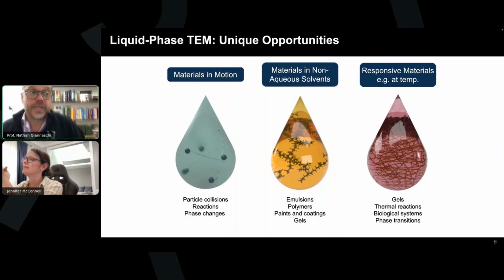The other area, we've had a lot of fun over the years with things like metal organic frameworks, because you can mix two components, right? The solvothermal syntheses, so you can mix metals and ligands and heat it up. The product is crystalline. So, anything where the product is indisputable in terms of its structure lets you study it dynamically and then even define the kind of beam damage that you observe. So those are the types of materials, I think, generally.